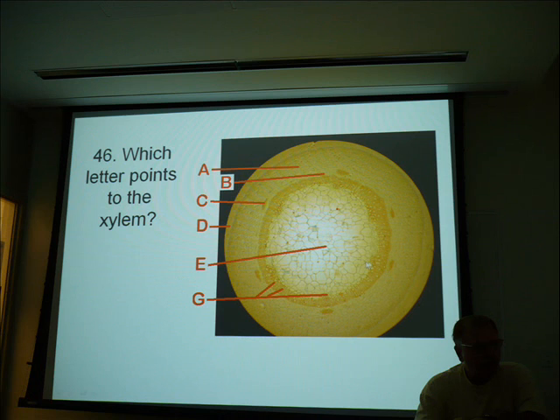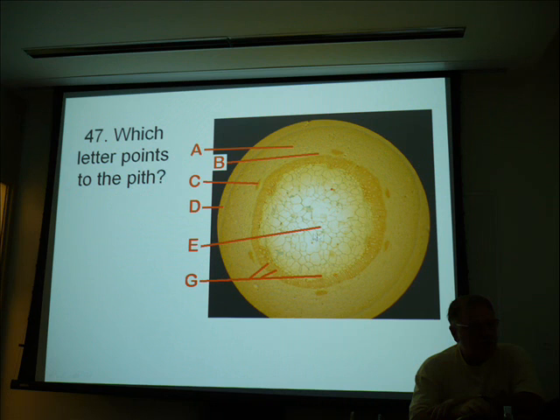All right. Xylem forms the ring. Yeah. It also forms the little things right there. G. All this is xylem, and the problem is, you can't feed this because the food's outside. You can't get to it. So this starts dying. And then you find your tree inside has a hollow area. And that's how nature has it done.